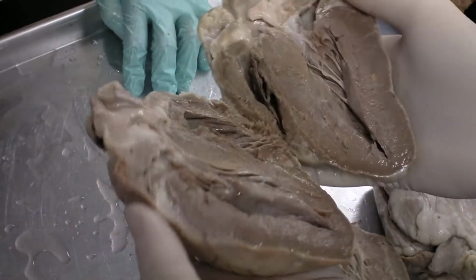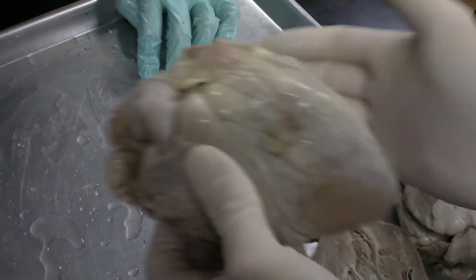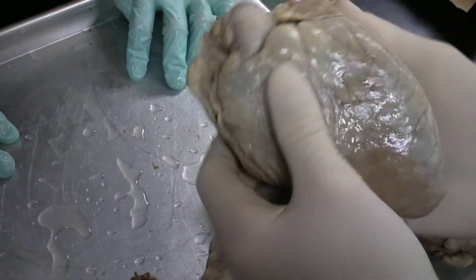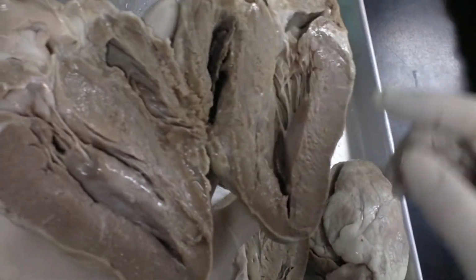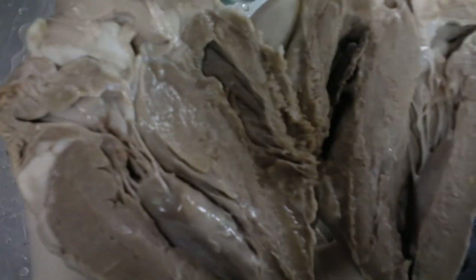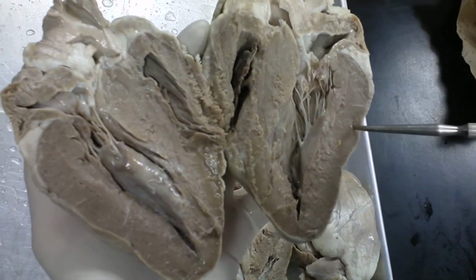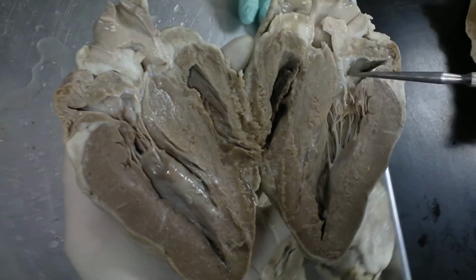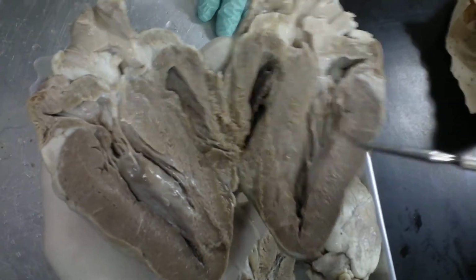So close the heart again. This is the right ventricle. So this is the left ventricle, left atrium. I'm going to have to use two hearts to show everything. So this is the atria on the left ventricle. So this is an AV valve. It's called the mitral valve.